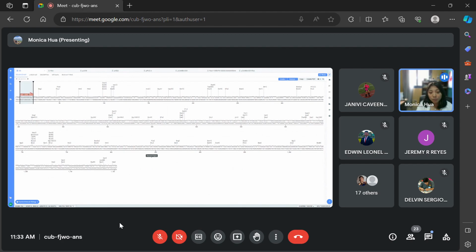And in order to design your primer, number one, you need to know what is the sequence you want from the organism, in this case, plant. The sequence we want is OD. We need a forward and reverse primer. Our forward is at the beginning of the sequence, our reverse is at the end of the sequence. After you design the primers, you send the sequence you designed to a company which basically builds the base pairs for you. This is how you would design your primer for PCR.